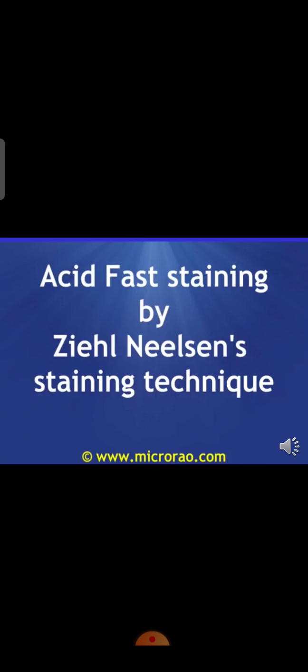We use a Bunsen burner or alcohol burner to heat the slide from underneath till steam is going out of the surface of the slide, but we should avoid boiling of the stain on the surface of the slide.